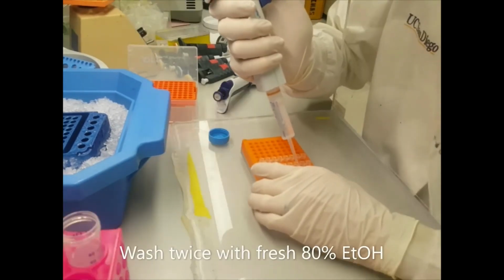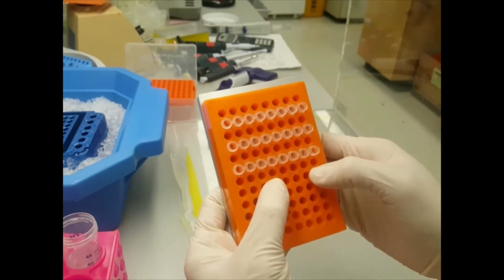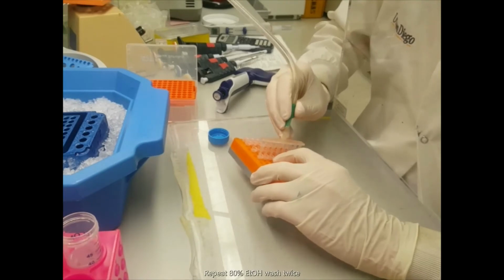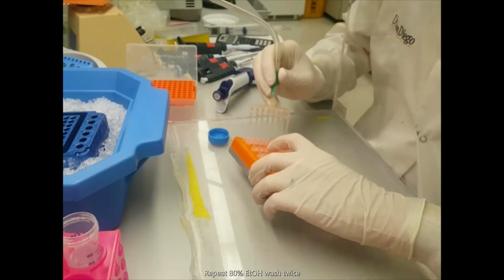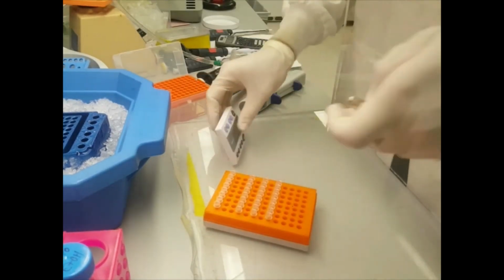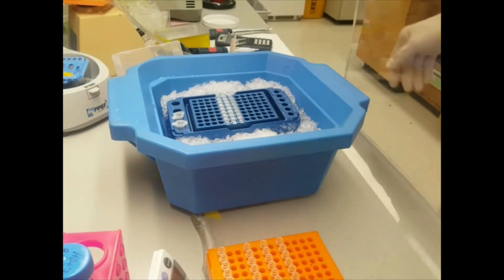Next, wash the beads twice with 80% ethanol. Prepare this ethanol fresh. A good way to wash the beads is to use magnets to make the beads fly from one side to the other side of the tube. After each wash, collect the beads and aspirate off the ethanol. After the second and final wash, quick spin the sample one more time to collect all the ethanol. Use once again a magnet to collect the beads and aspirate off all remainder of ethanol. Let the beads dry for 3 minutes, but it's important to not extend this time beyond 3 minutes.